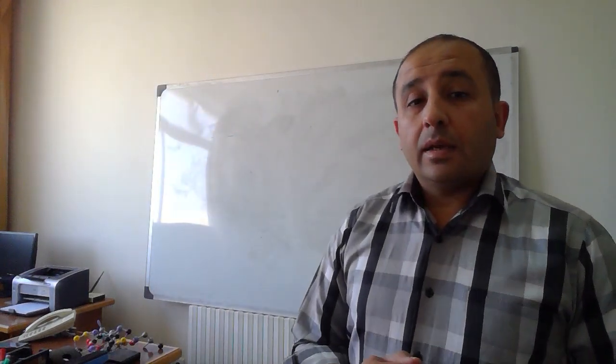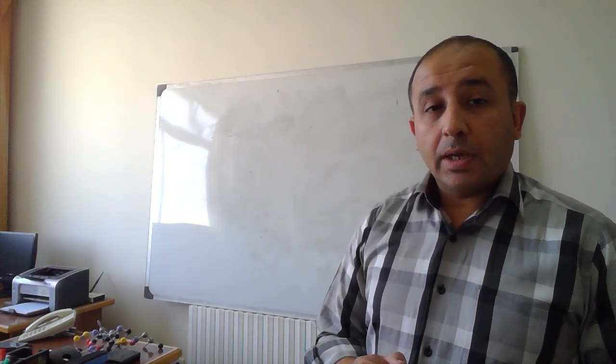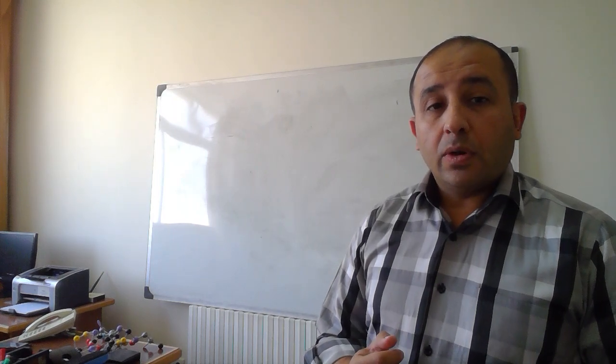Hello, today we will continue talking about gas chromatography. If you remember, we mentioned so far that the volume which should be injected into the machine should be very minimal. The second thing is that both solutions, the reference solution and the test solution, should contain an internal standard in order to correct any shifting due to the change in the volume of injection.